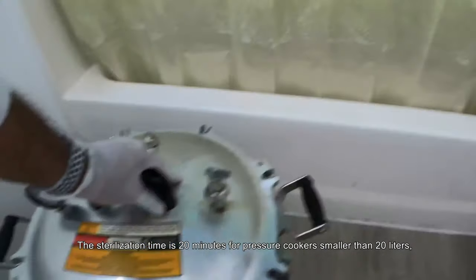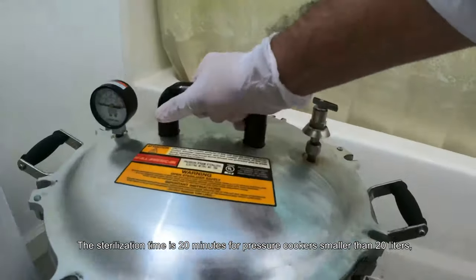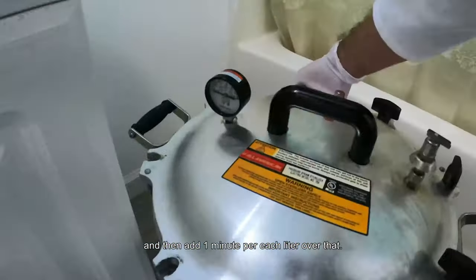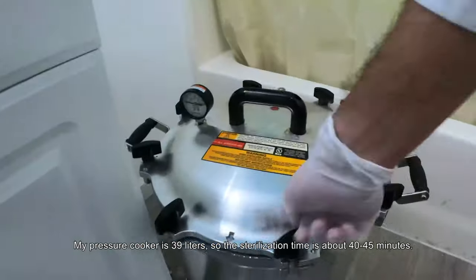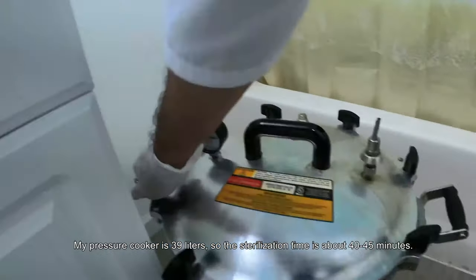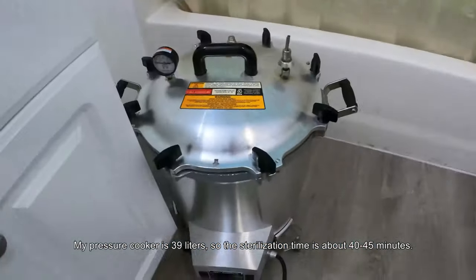The sterilization time is 20 minutes for pressure cookers smaller than 20 liters, then add one minute per each liter over that. My pressure cooker is 39 liters, so the sterilization time is about 40 to 45 minutes.